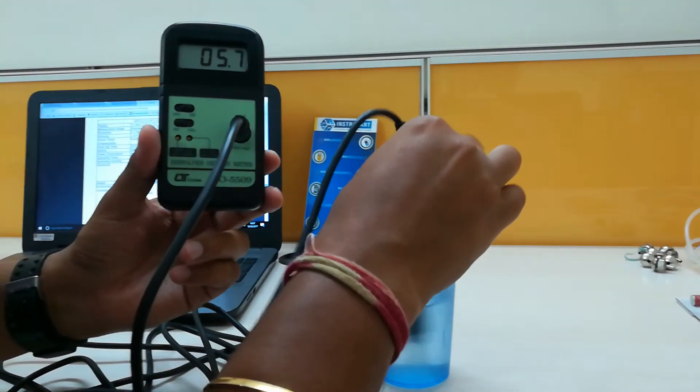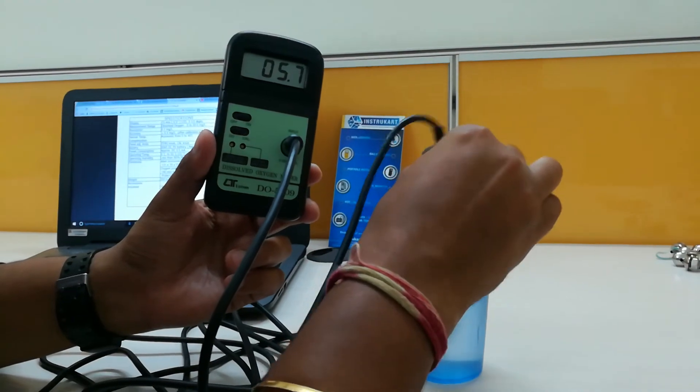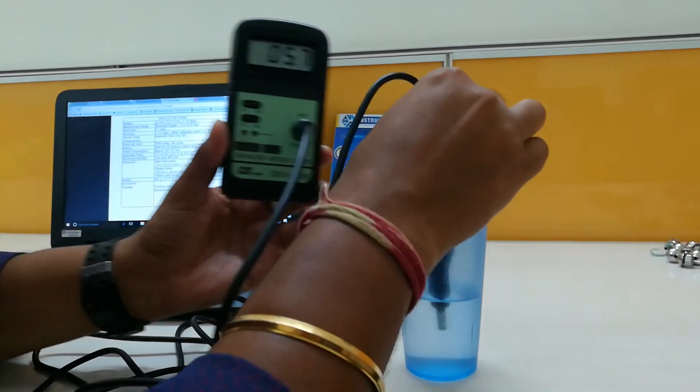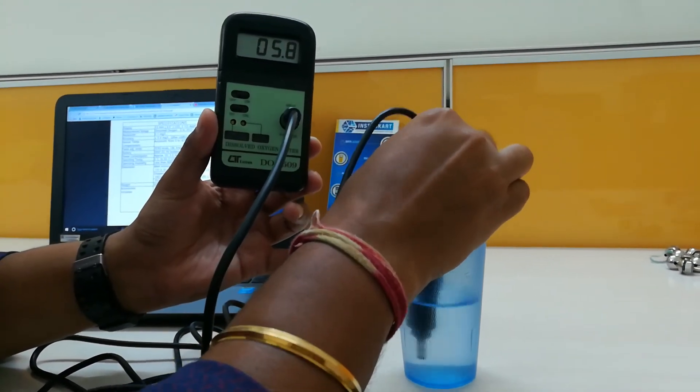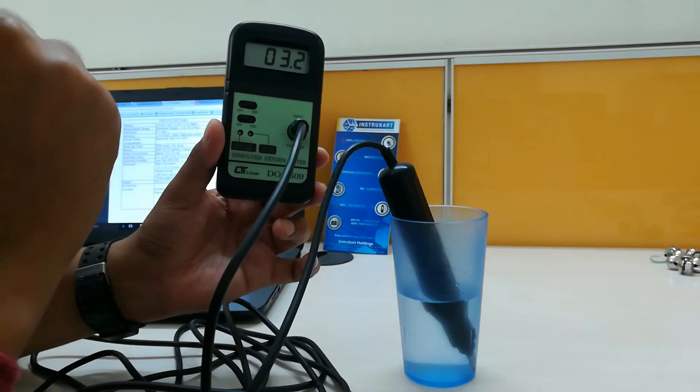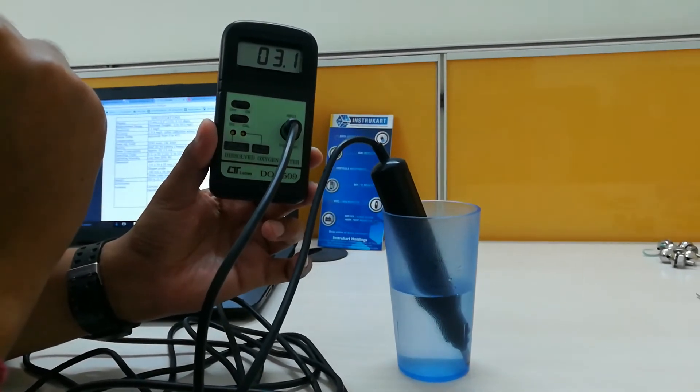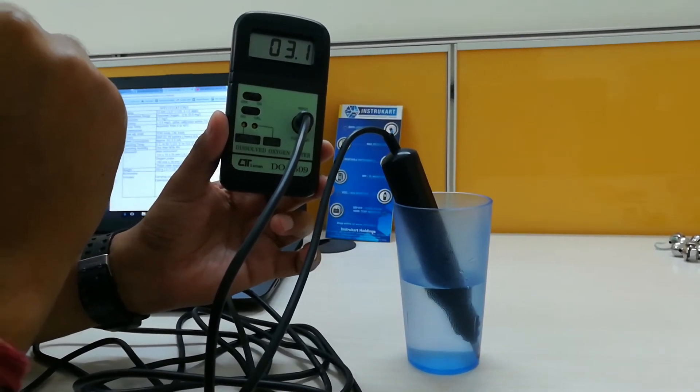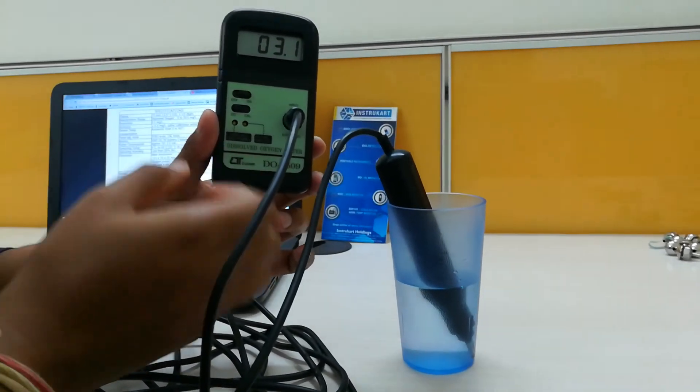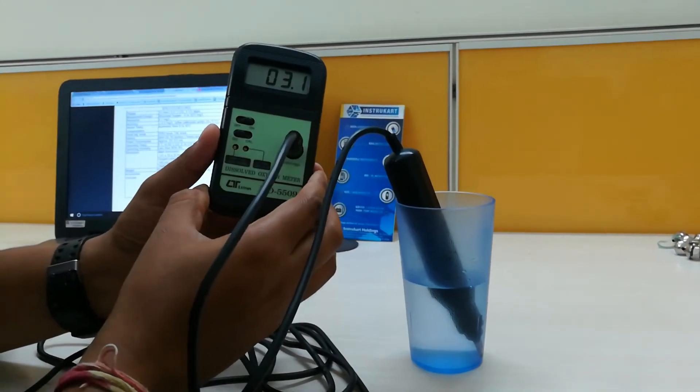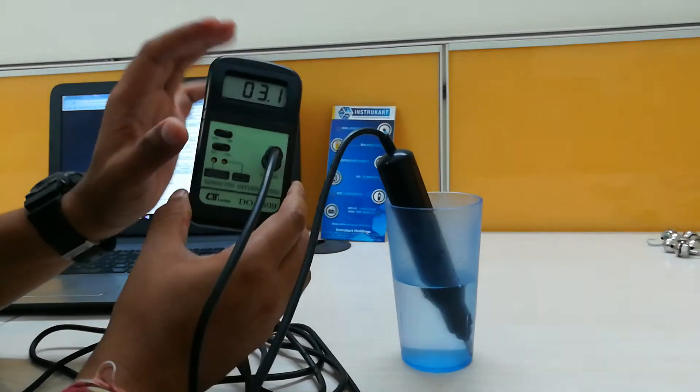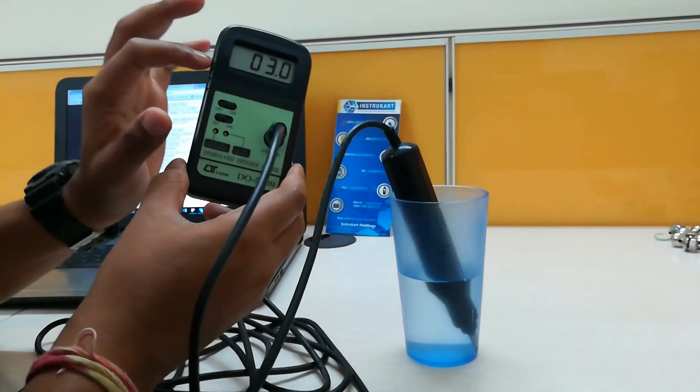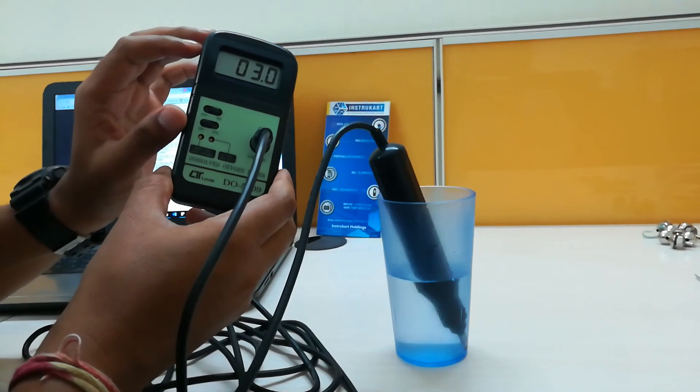Again, see that. Right. So you can see the difference for this. We have a pen-type model also in Lutron.